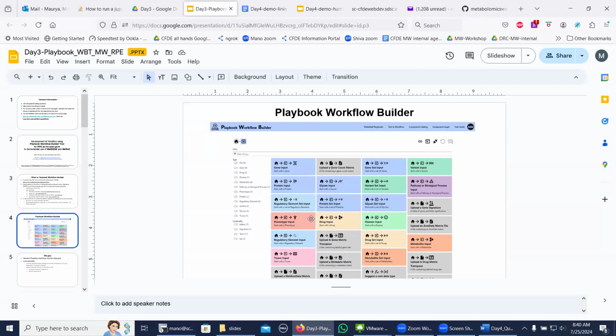And the tool set that we see here is an expanding set of tools. Users are also welcome, if they have their own tools written preferably in Python or TypeScript/JavaScript type of language, to integrate those tools. You can create your own modules following the detailed guidelines provided at the GitHub page.